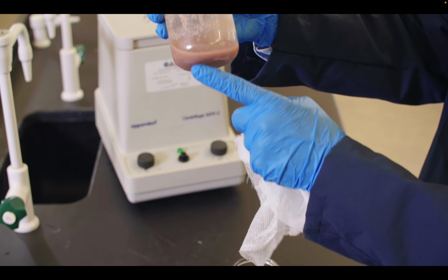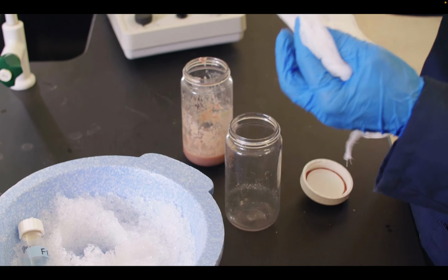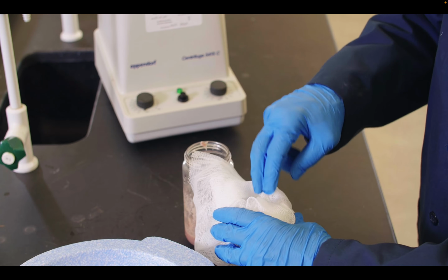All right, so we have fraction 2 again. I have our GOT in here. You notice it's kind of clunky and chunky, and so a lot of proteins and other cell debris is here. We need to clarify that. That is, we need to get rid of that as much as possible. So we're going to use something fairly standard and fairly routine in terms of everyday life, in the kitchen: cheesecloth.